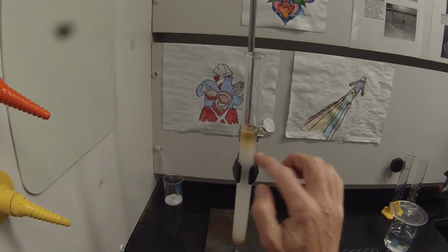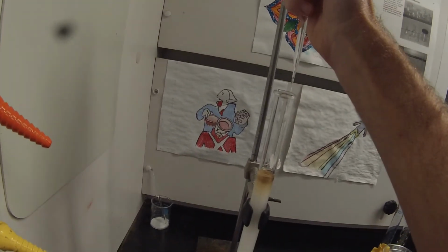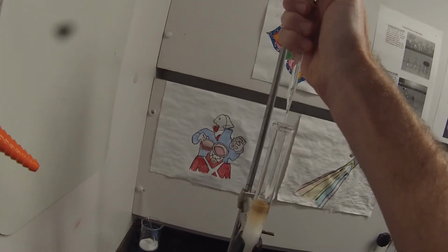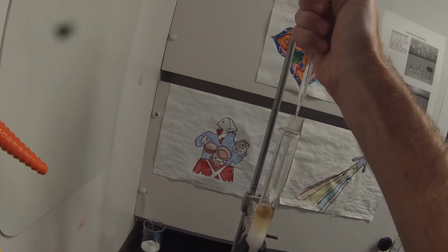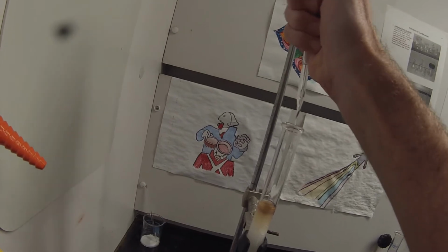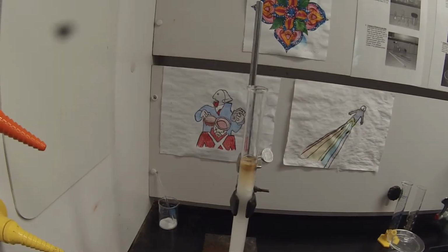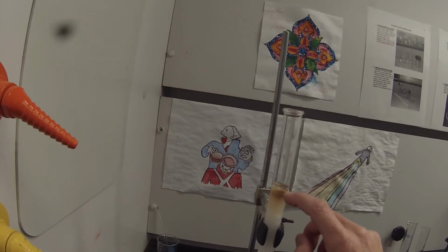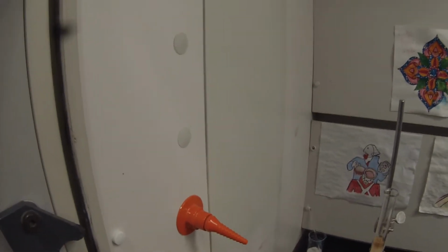You see there's a little crack already. I want to make sure that crack doesn't get any bigger. So I want to flush that in so that my compound is well and truly loaded on the column, and minimize the air bubbles. Alright, you see I got a little bit of an air bubble, which I will get rid of with some pressure in a minute. So it's pretty much clear and colorless above, which means I think I've got my compound on.